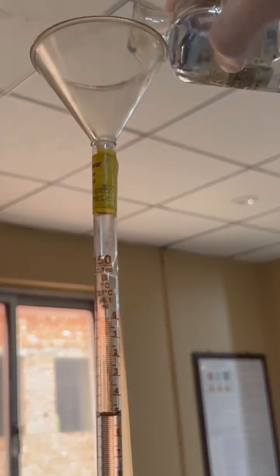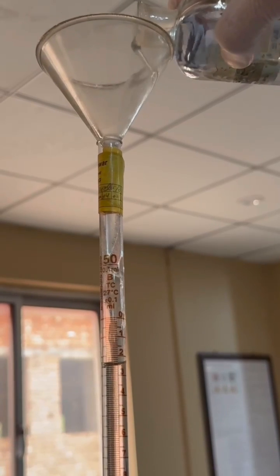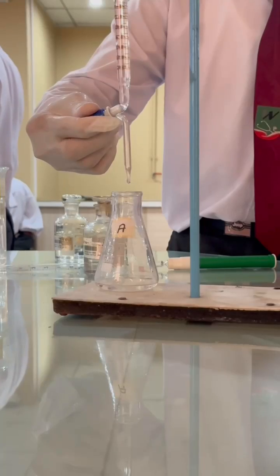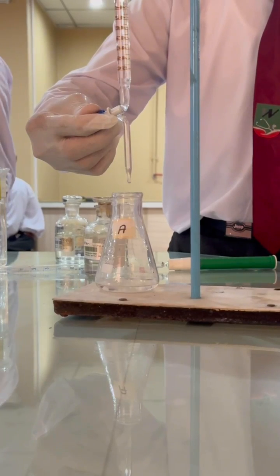Put 0.1 normal NaOH in a burette up to the mark of zero and start the process of titration.